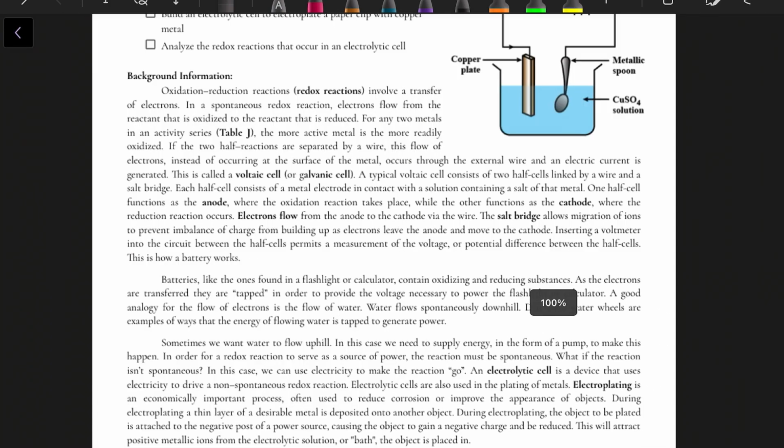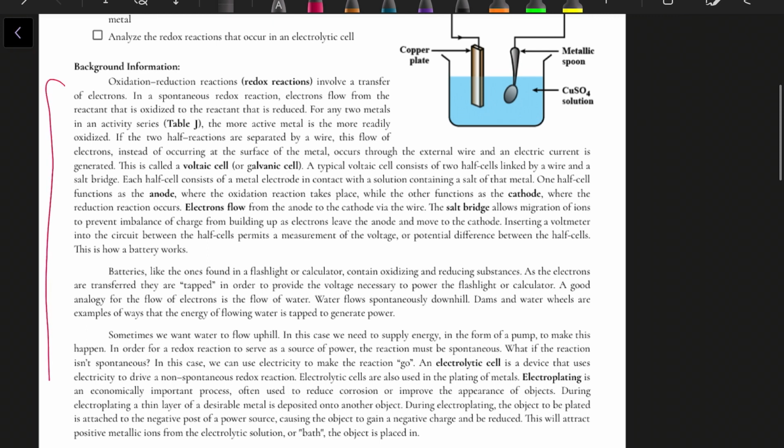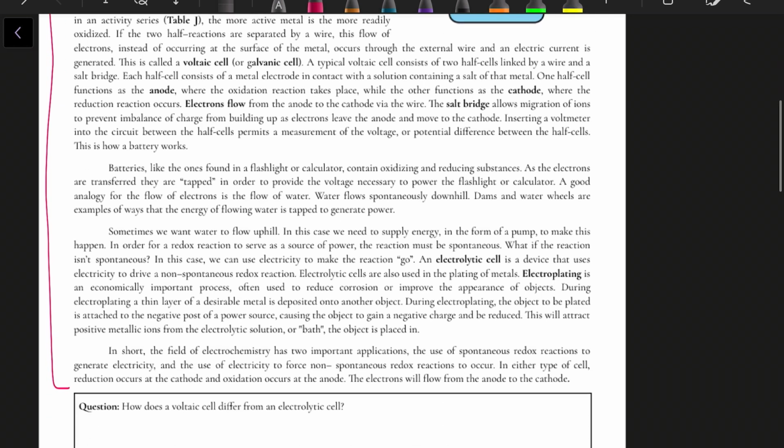So, as always, your background information has a bunch of relevant information. Now, in this lab, we're just going to make an electrolytic cell, but the background information also talks about the other type of electrochemical cell, the voltaic cell. So you get a good review of essentially all things redox.